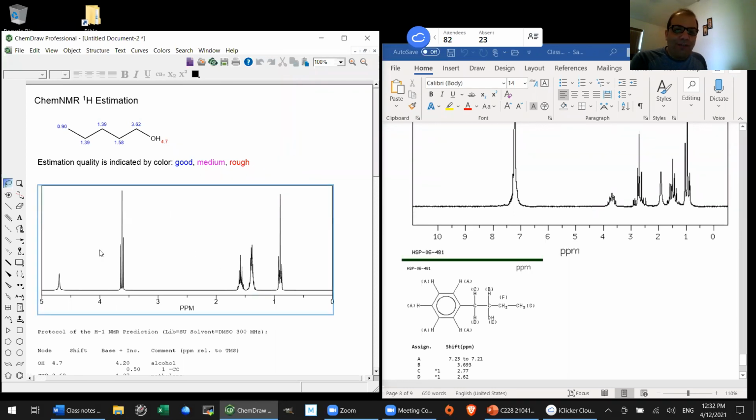So this looks much better than the spectrum that they had for me. If we look for that CH2 over here, it says it's at 1.58, so here you go. I think you'll see it's not just 5 lines, it's way more than that, nor is it a nice even 1 to 4 to 6 to 4 to 1 pentet. There's other fuzziness going on in there. And indeed the same thing for the other two.